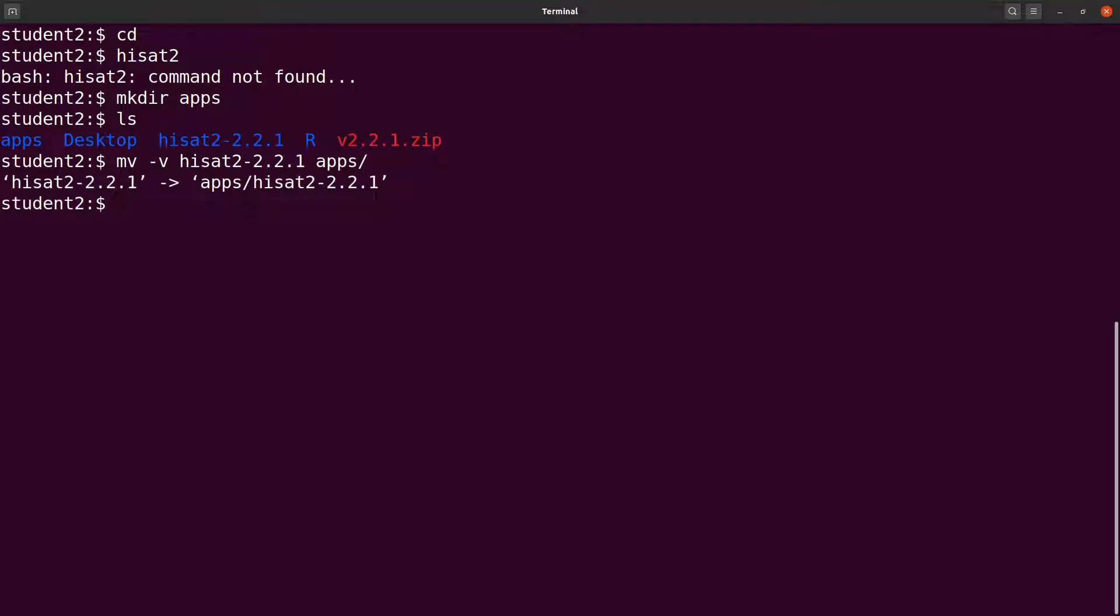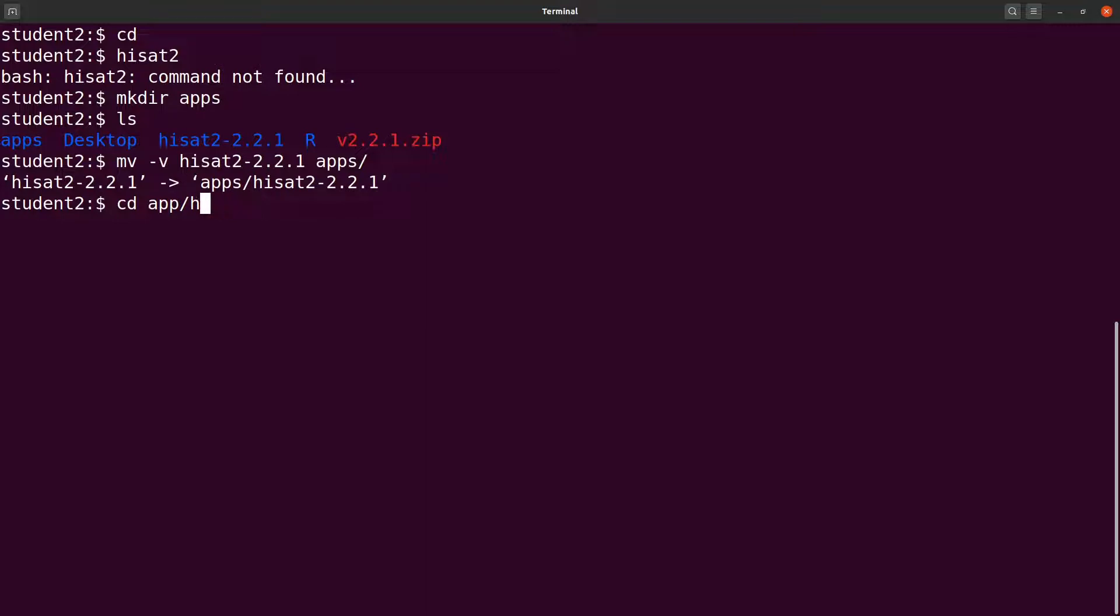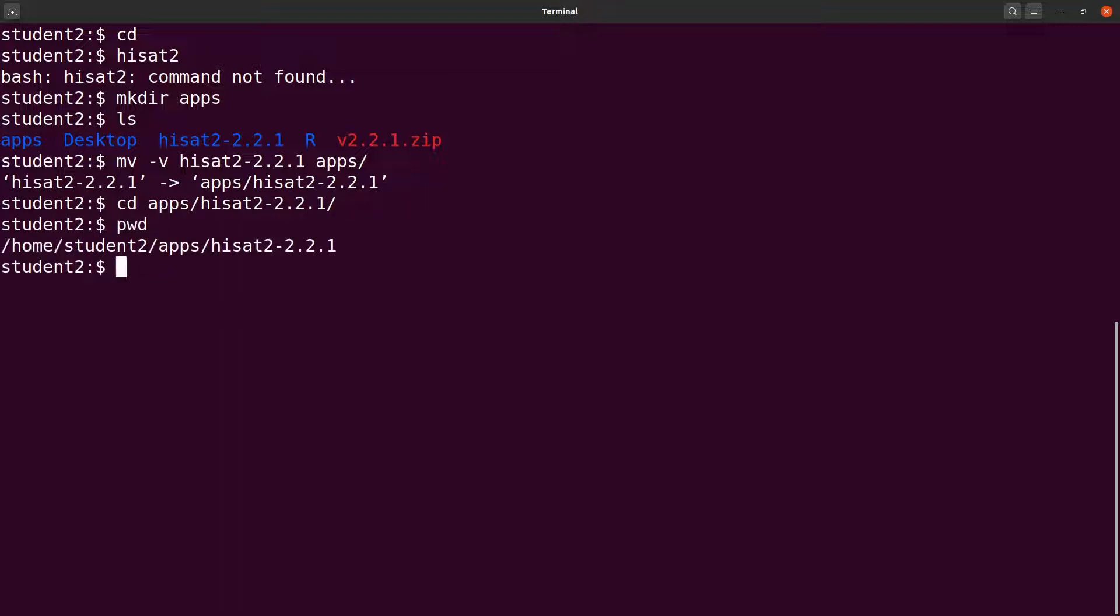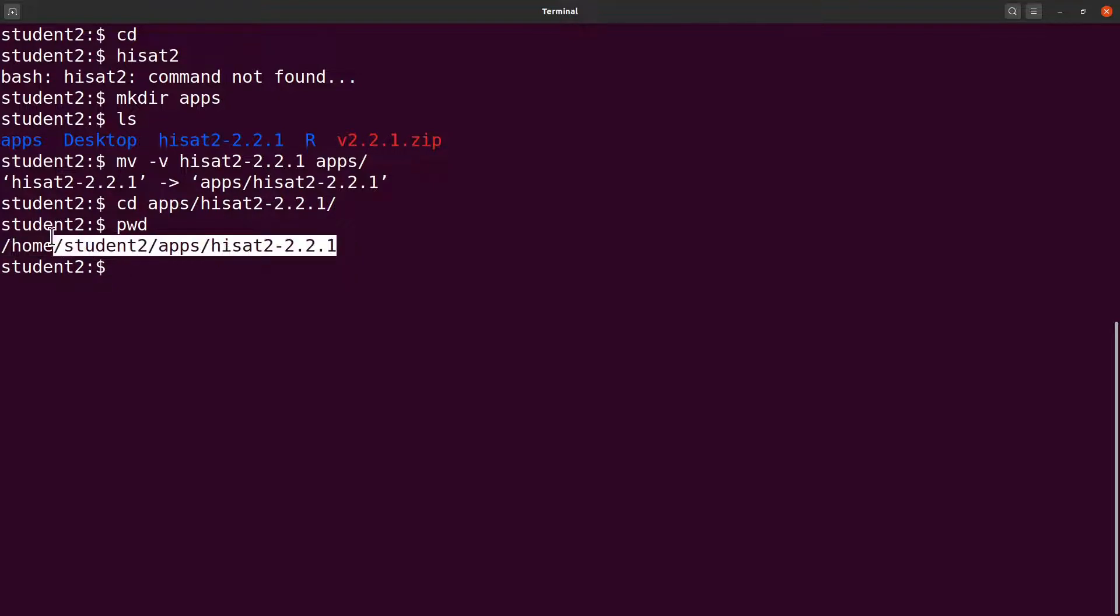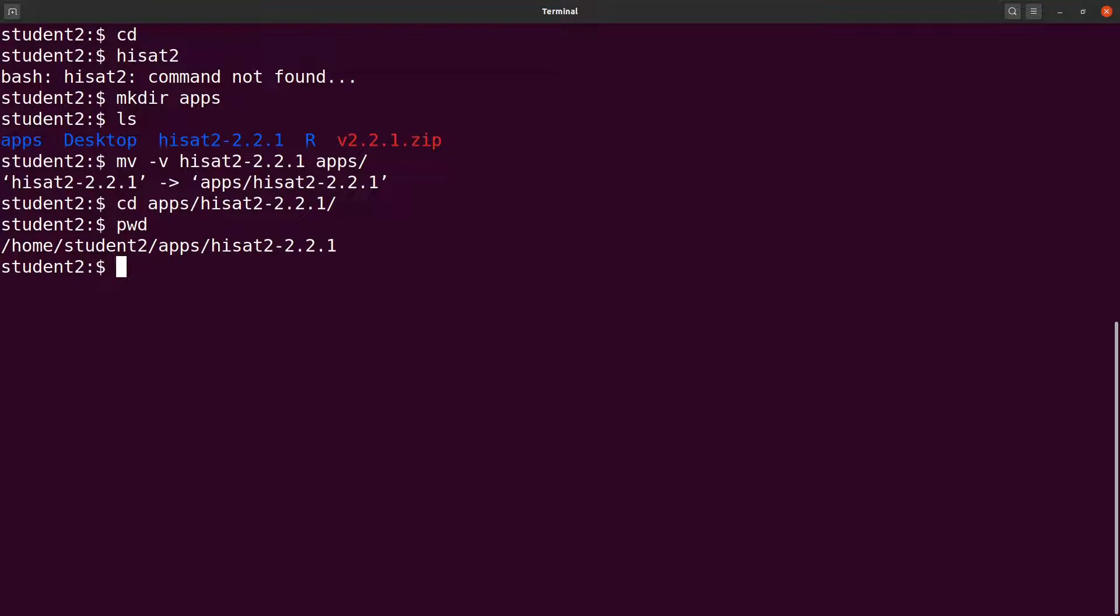After that, I want to also get the full path of the binary. I'll cd to apps/hisat2 and then I'll issue the pwd command. And then this path that has been displayed is what I'll use. I'll just make sure I have it copied. And then I'll cd back to my home directory.